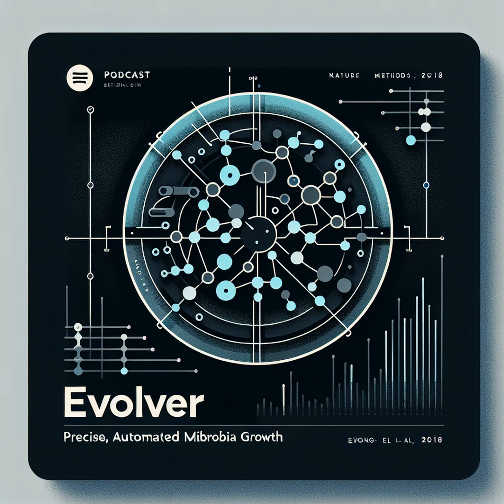The main takeaway is eVOLVER's ability to perform complex, high-throughput experiments. Think evolving yeast populations under multiple selection pressures or screening entire yeast knockout libraries to discover genes involved in things like stress response or adaptation. It's a game-changer for fields like molecular evolution and systems biology. Now, let's move on to the specifics of how they designed and built this incredible piece of kit.